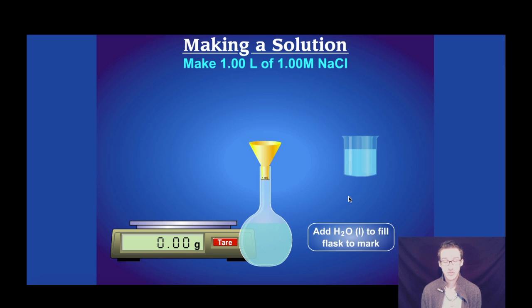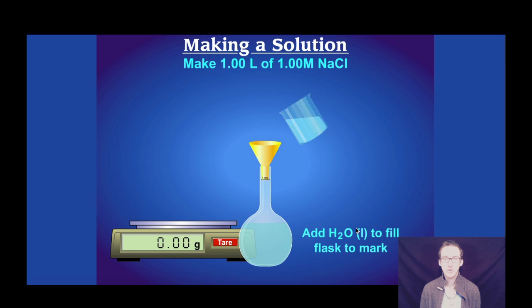And so you saw some very awesome flipping of your flask there. Then you're going to add H2O to the flask fill mark. And again, these volumetric flasks have been very carefully calibrated to fill the exact volume that is indicated.